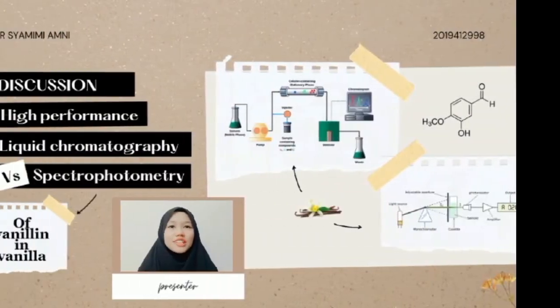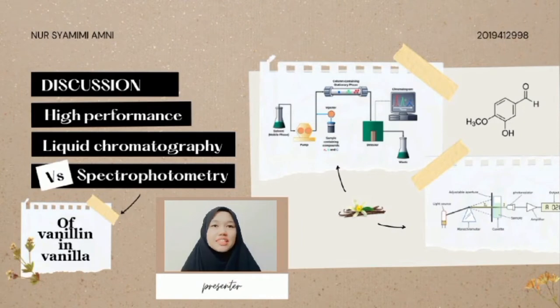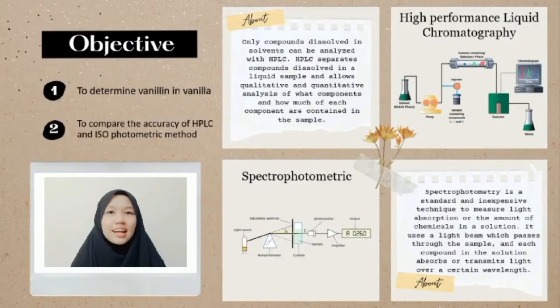Hi, I am Nur Syamimi Amni binti Rismayadi, the representative from our group to discuss our findings in this study. The objective of this experiment was to determine vanillin in vanilla using high-performance liquid chromatography. The other objective of this study was also to compare the accuracy of HPLC and spectrophotometric methods.